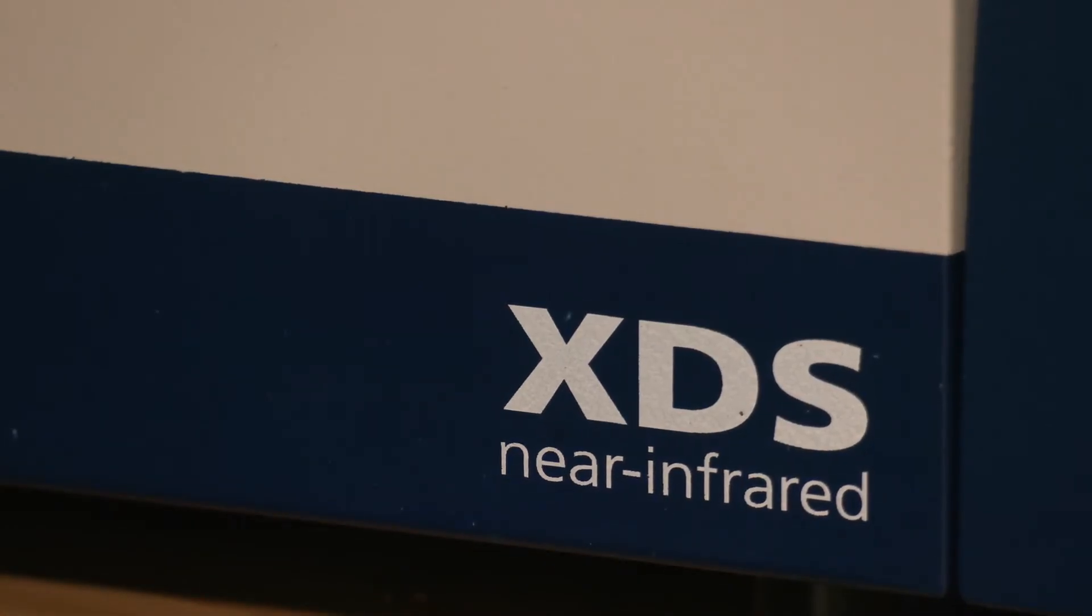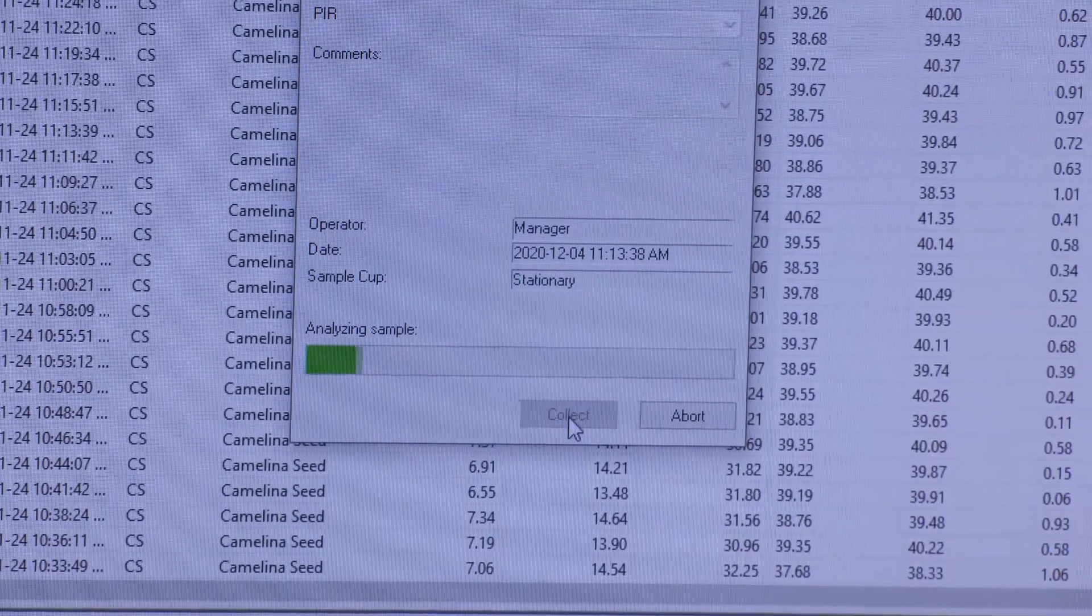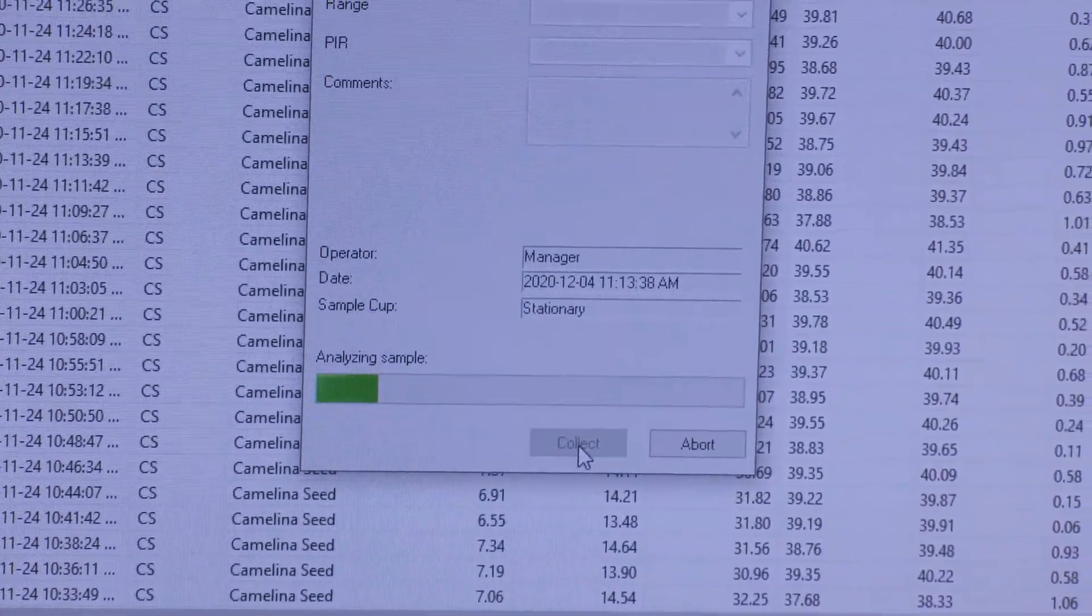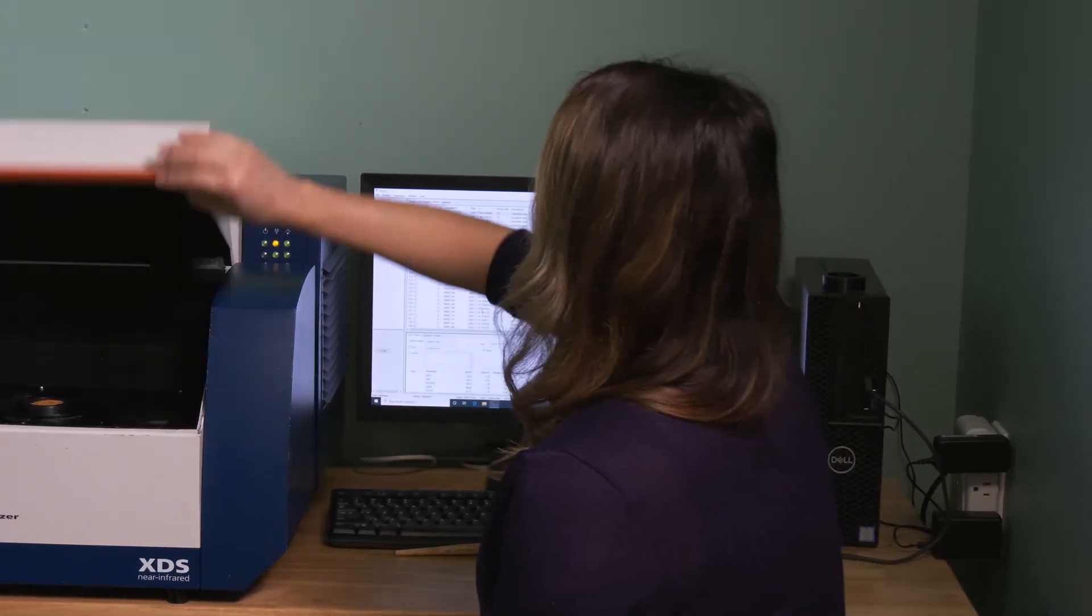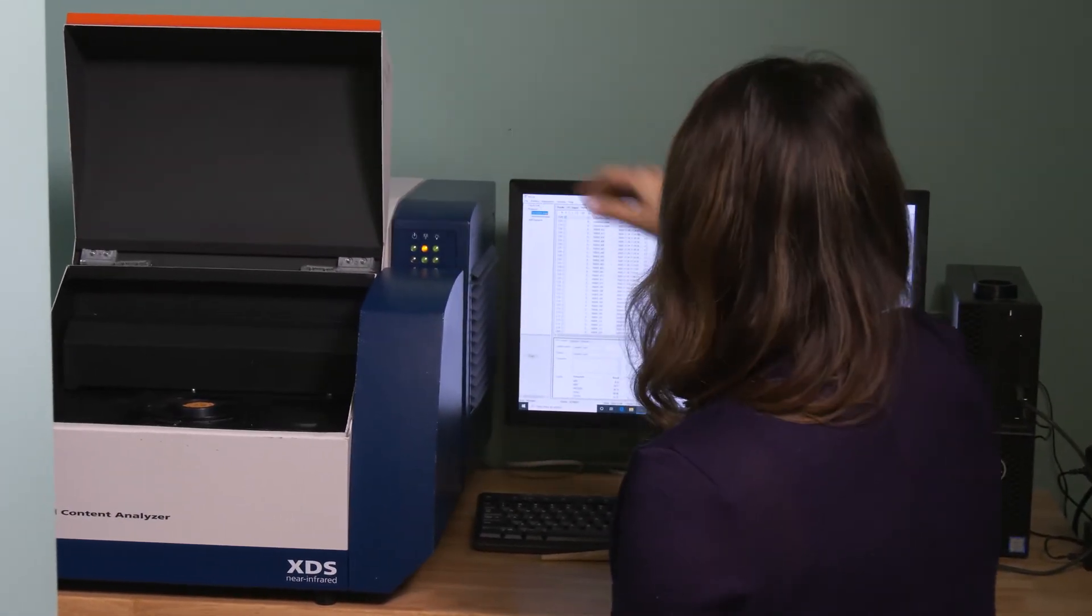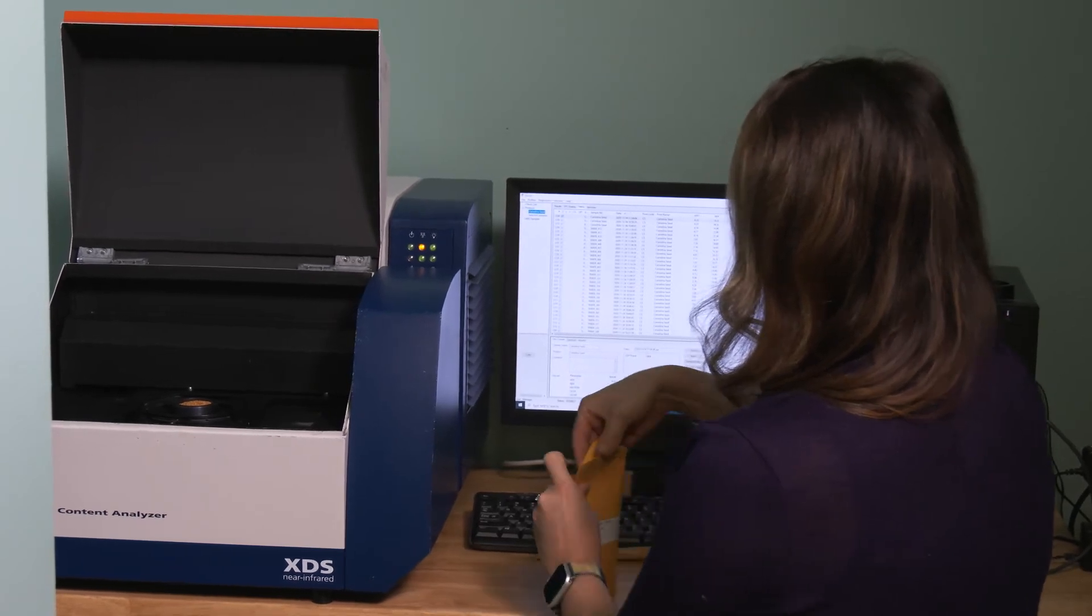This NIR machine uses near-infrared spectrometry to analyze each of our potential varieties using different wavelengths of light. It allows us to quickly determine the oil and protein content of the Camelina seeds.